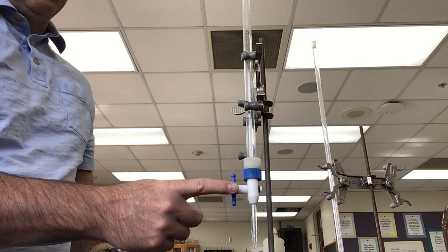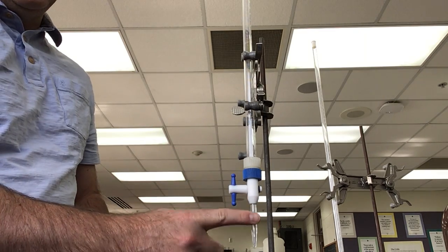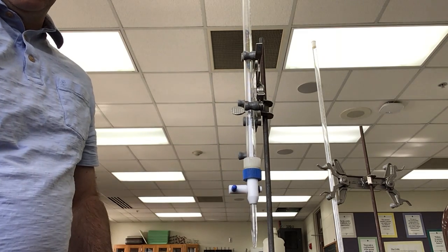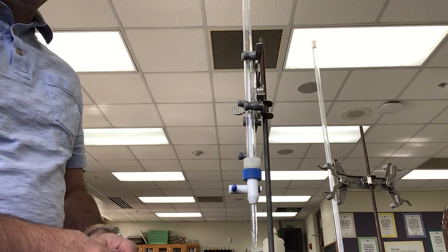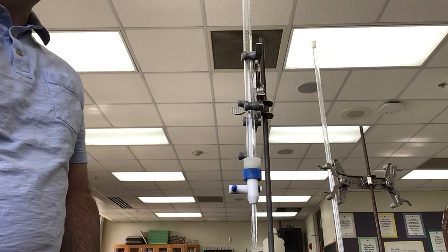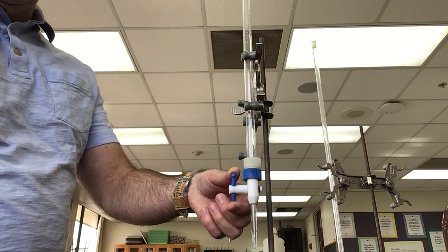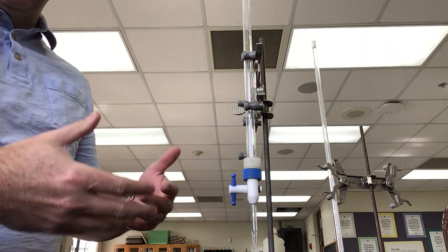Right now, with the valve here in the same plane as the tip here and as the Buret, this is in the open position. Perpendicular would be closed. And that's actually the same for plumbing. So that's a nice tip for working at home. Again, this is closed, this is open, but then you can turn it part way and have your titrant, your liquid in your Buret, just come out a little bit slower at a time.